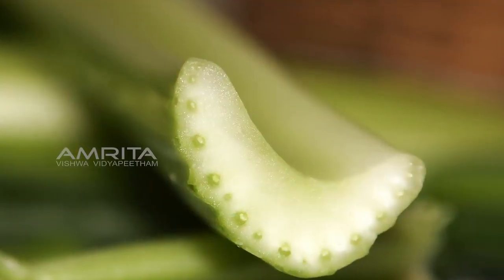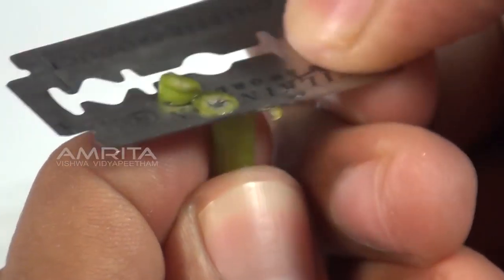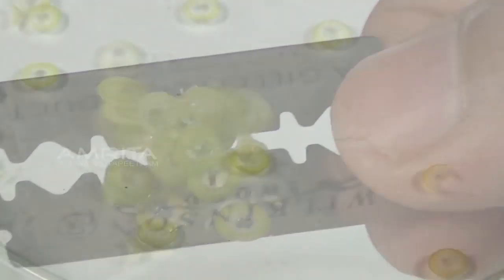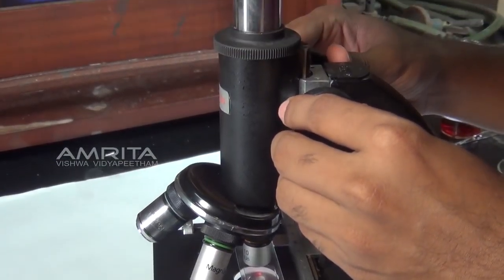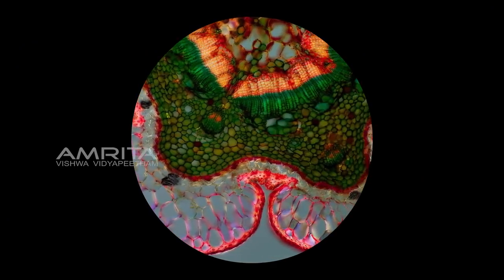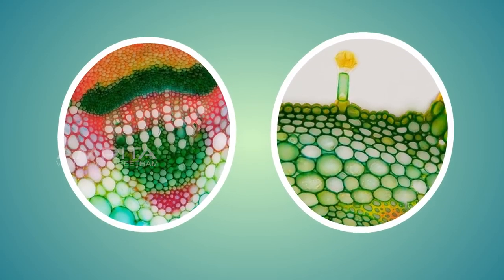To study the structural details of the stem or root of a monocot or dicot plant, it is essential to get familiarized with the sectioning and staining techniques used with plant materials. It is also necessary to take the sections with uniform thickness so that the light passes through them equally and the different tissues found in the material are clearly visible under the microscope. To examine the tissues clearly, it is desirable to stain the section with suitable stains, as different stains color the tissues differently.